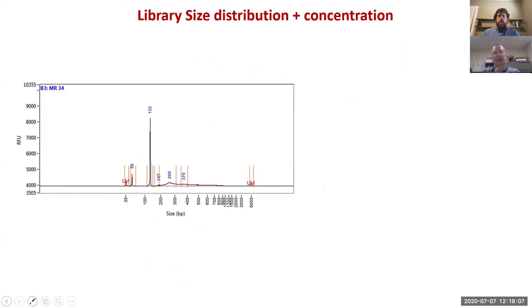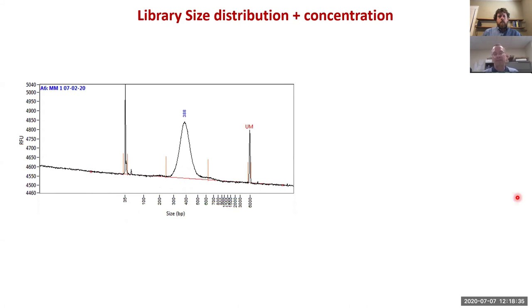Before we do the sequencing there's a quality control step and that's actually really important. This is an example of a library which was submitted. This is actually a sample which wasn't very good because there's significant contamination with the adapter still left which is really not very good. There's a pretty broad distribution of the sample which can also be problematic. What we aim for is a nice clean library where there's no adapter contamination and a fairly narrow size distribution of the library.